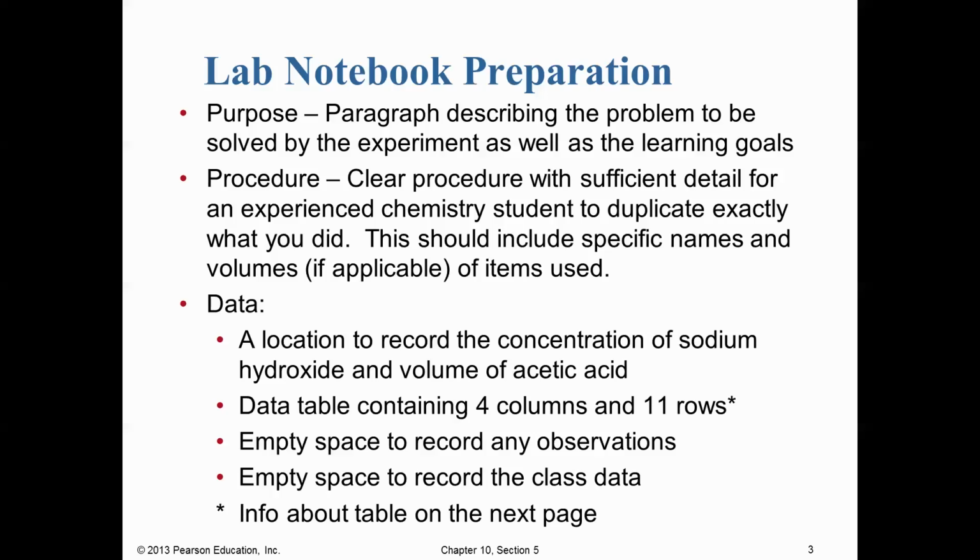All right, so let's talk about preparing your lab notebook. Before you come to lab, you want to make sure you have your purpose recorded in your lab notebook. The purpose is going to be a paragraph that describes not only what the goal of the experiment is, what problem we're trying to solve, but also what the learning goals are. Like those objectives we listed on the previous page. What does the instructor want you to hopefully learn from this experience?